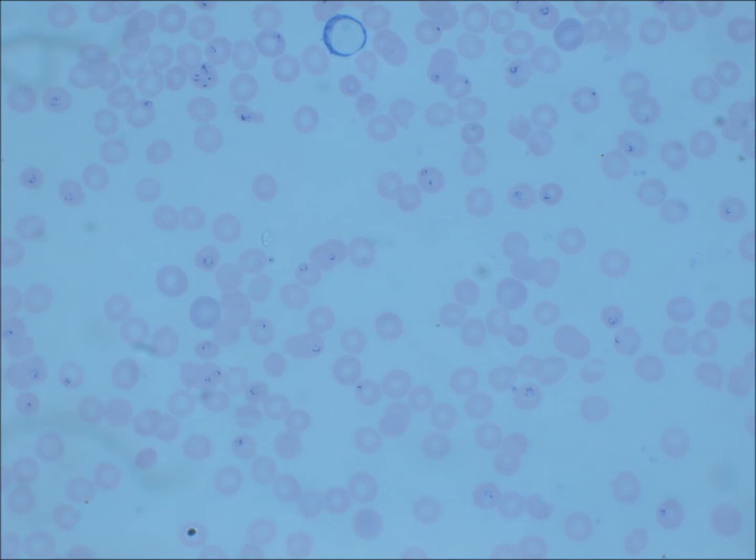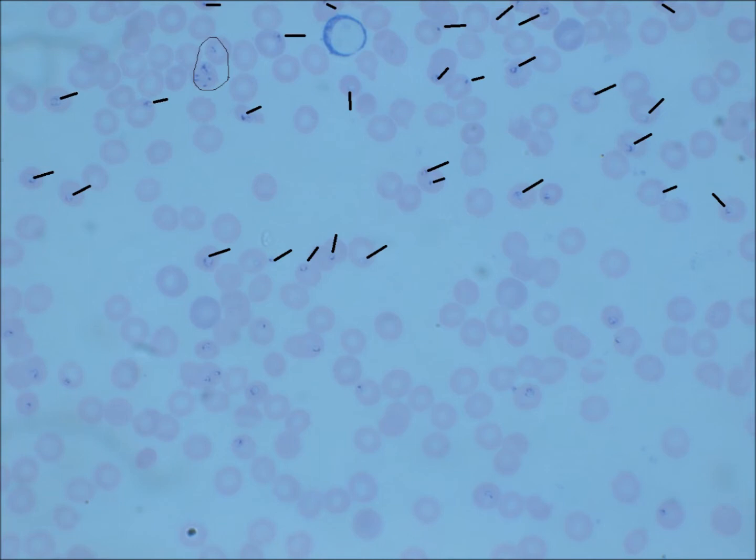We are also looking at location. All of these Babesia are inside of the red blood cells, which makes sense — they are intracellular pathogens, meaning they develop inside of cells, in this case red blood cells. I've added tick marks so you can see some of the Babesia more clearly. There's plenty of Babesia on the lower half of the slide — this slide is littered with Babesia and is absolutely infested.